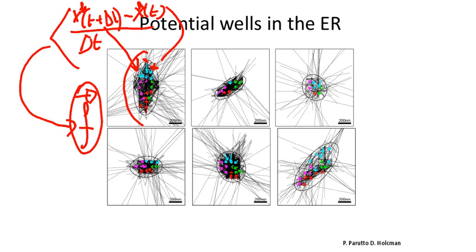And what we found, as shown here, is that we could see arrows of different colors that converge here toward the center that I'm showing now. And this is not only one isolated case. We could see it repetitively at different positions, and actually most regions of high density are characterized by these converging arrows.